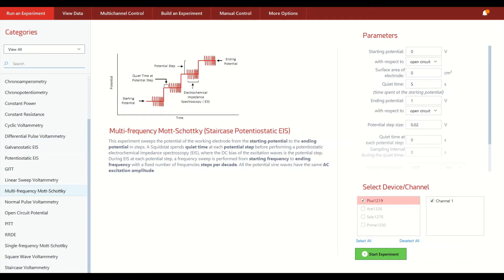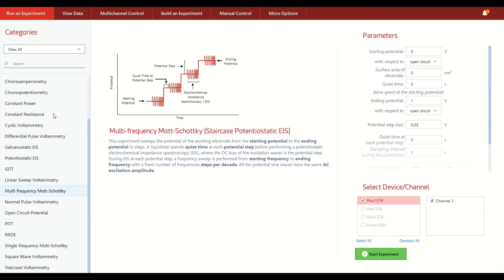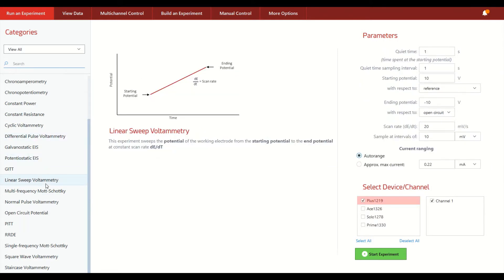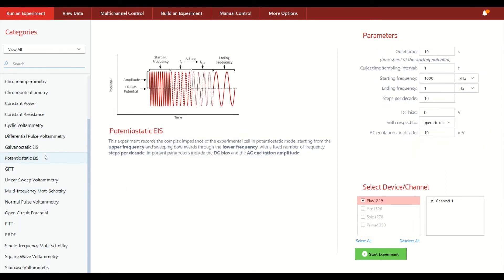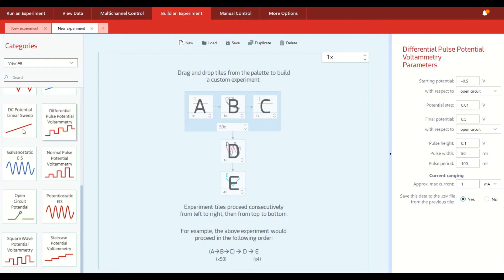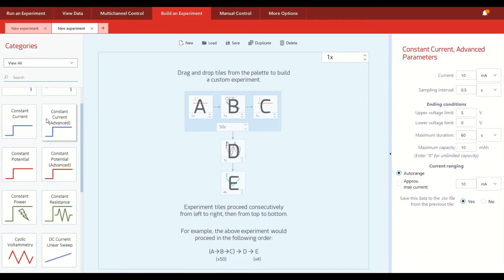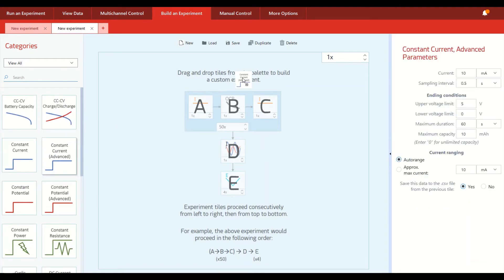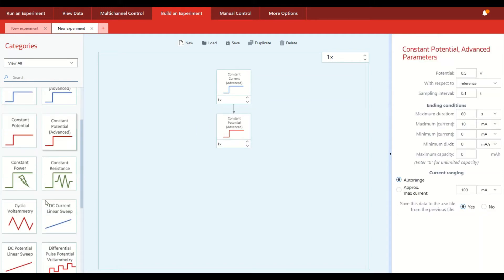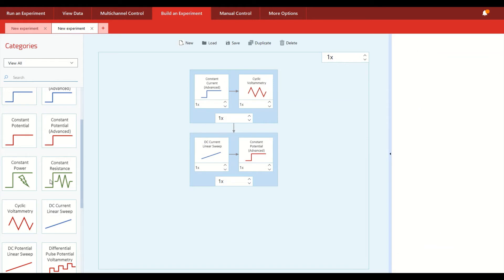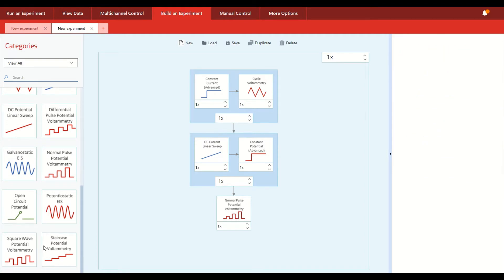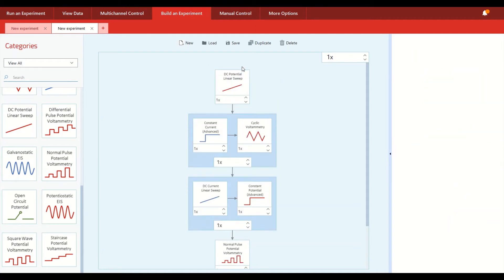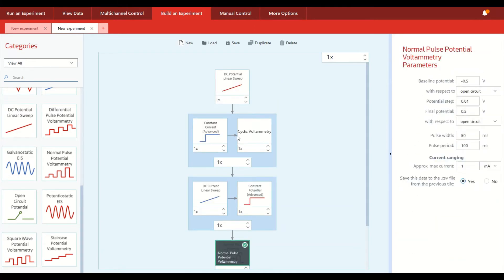Now if there is ever a time when you don't see the particular method that you want to run on the software here, or perhaps you simply want to chain together multiple experiments back to back, therefore saving time not having to tend to your Potentiostat, we have our build an experiment screen, which allows users to create their own custom experiment by using the building blocks on the left hand side of the screen here. It can be dragged and dropped into the sandbox such that you can configure basically any sort of customized experiment based on whatever parameters suit your needs. And it's simply a matter of following the arrows to know the order in which all of these different methods are being run.